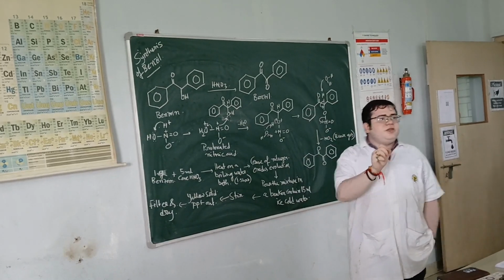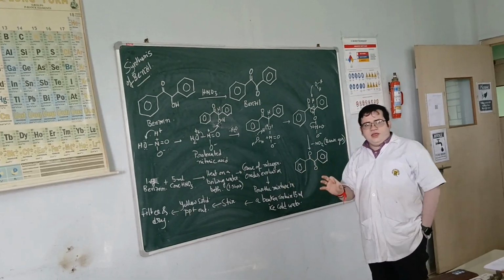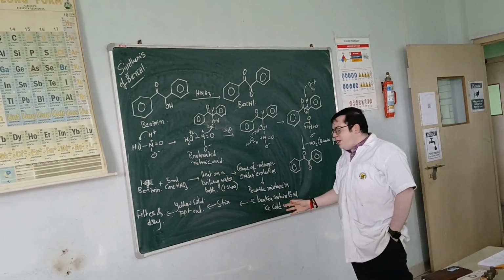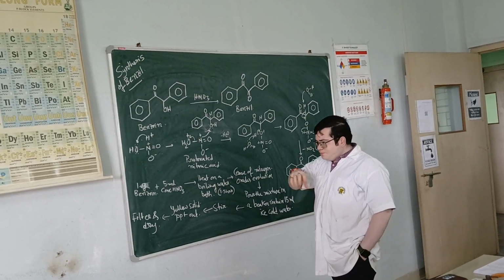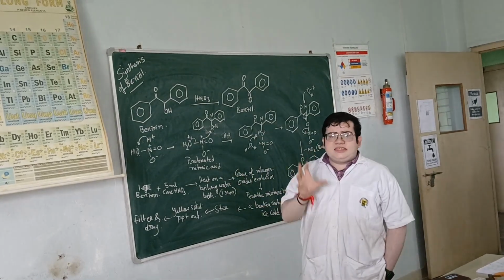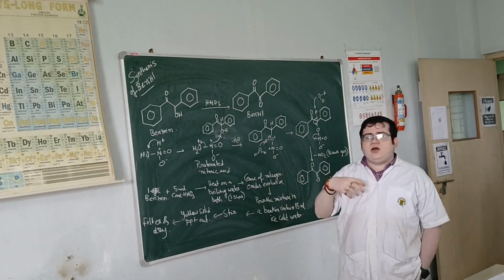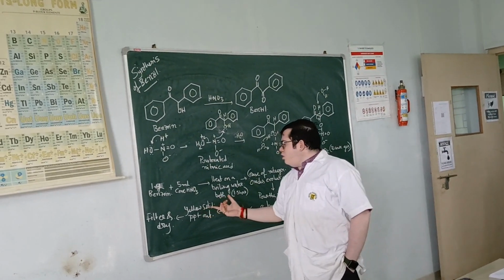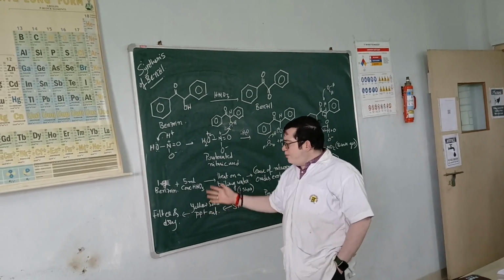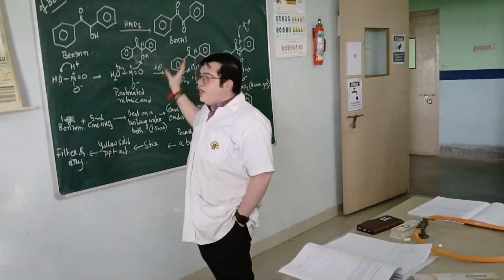Whenever the reaction has been completed, you have to pour the reaction mixture into a beaker containing 15 ml ice cold water and gradually stir it. On stirring, you can see that the yellow oil part will crystallize out as a yellow solid precipitate. You have to filter it and dry it. That's all for the reaction part.